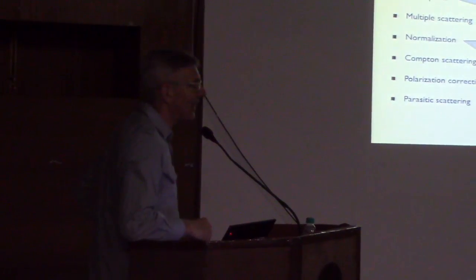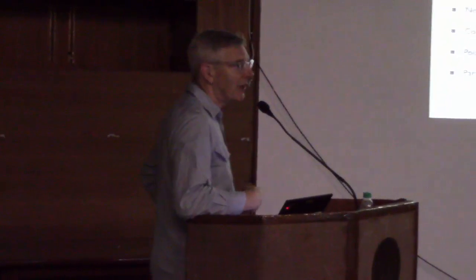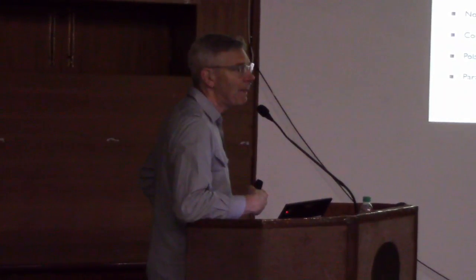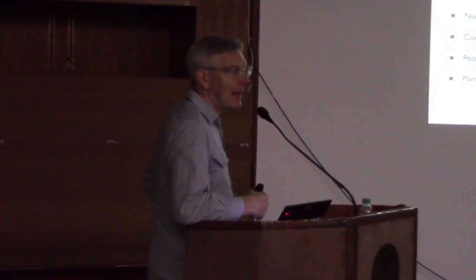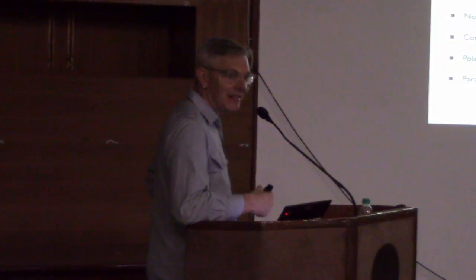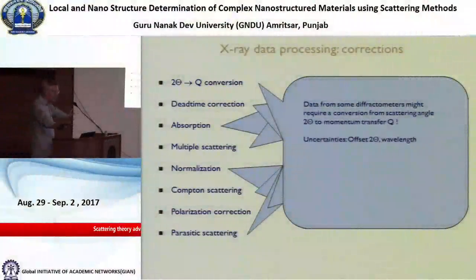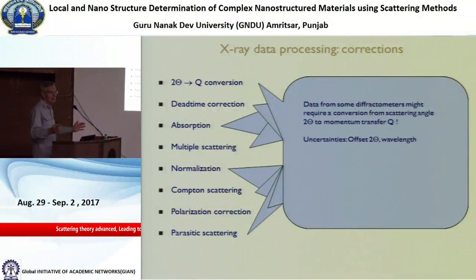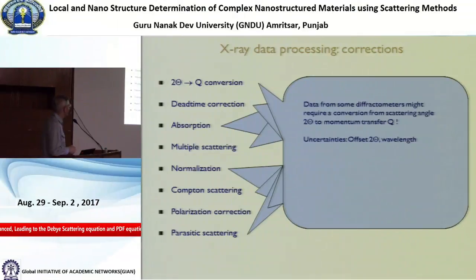This needs to be done very accurately. And the way that we do it is that we measure samples where we know very well the lattice parameter. And then we make a kind of a calibration map so that the pattern is correctly determined. And then we don't change anything. We don't touch anything. And then we do the experiment again with our sample, and we assume that when we measured our sample the calibration didn't change, and that's a good assumption.